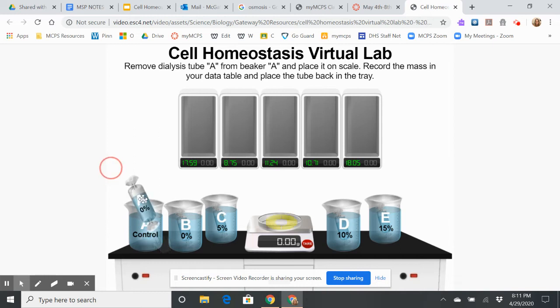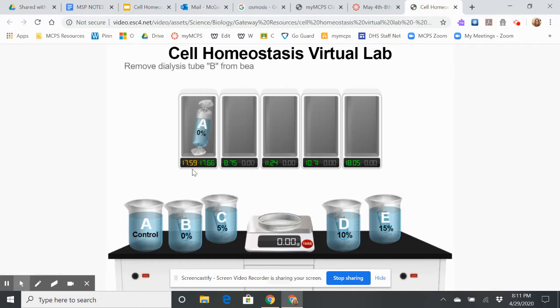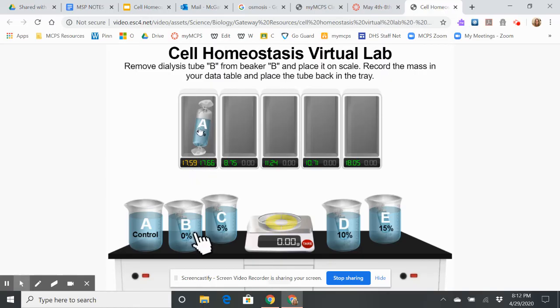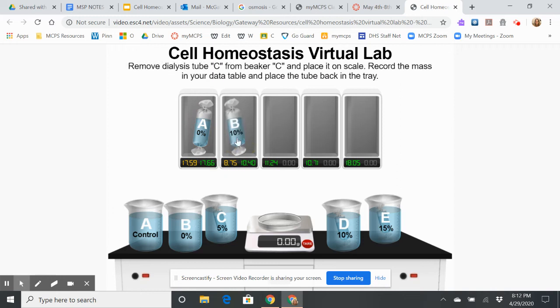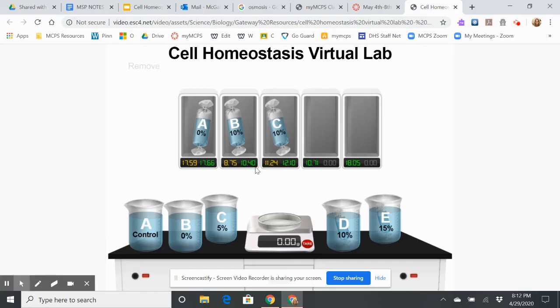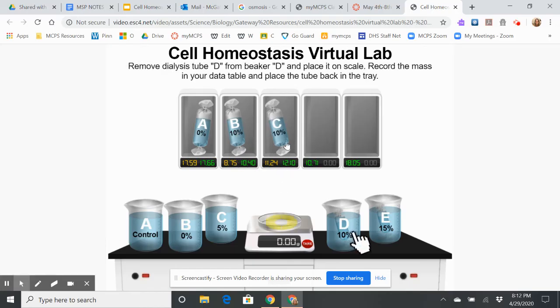Now I'm going to take the tubes back out and mass them again. This first one started at 17.59 grams and ended up at 17.66 — it was 0% inside and the control was 0% outside, which we would call isotonic. The water moves in and out at the same rate. The second one was a 10% solution placed in a 0% solution, and you'll notice it gained mass — water moved into the dialysis tube. In the 5% solution beaker, it also increased mass, but not as much. From 0% to 10%, it increased a lot; from 5% to 10%, it increased a little. Water moved into the tube and would cause a cell to expand.